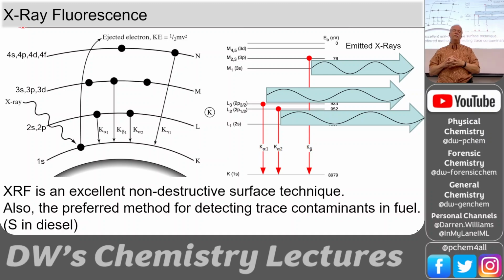But those are just ubiquitous. They're everywhere. You couldn't really tell if it was just background carbon from our pine trees or if it was from your sample. So carbon is everywhere, and a lot of times we don't even look at carbon for X-ray fluorescence. We're looking at third row or greater.